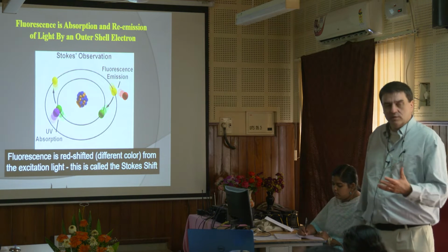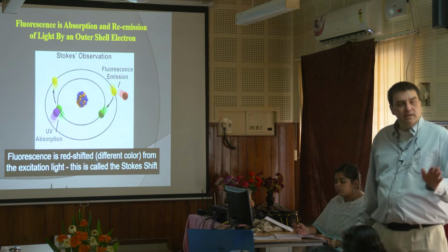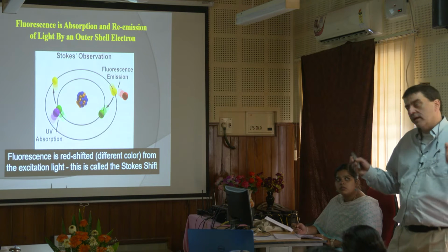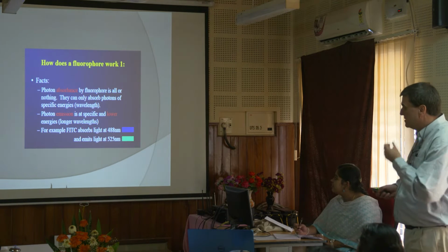Sometimes you're forced to use it just because you have an antibody that's tagged with it or something like that, but if you can avoid the FITC, try to. The Alexa dyes are fabulous. I'm not getting paid by the company, but I just really like them because they work well.